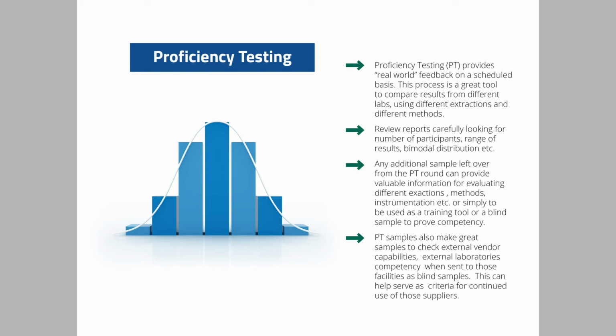Also, equally valuable as that PT report is any additional sample that's left over. Just as we talked about the quality control materials, these PT samples can be used for training or evaluating different methods or extraction procedures, or simply sending back through a laboratory as a blind sample to prove competency.